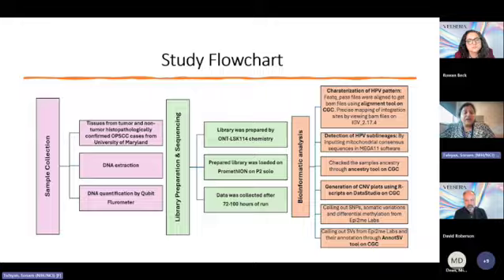SNPs and the somatic variations were called out from Epi2me Labs, which is the software for analyzing Oxford Nanopore technology sequencing runs. But the SVs were annotated through the AnnotSV tool on Cancer Genomics Cloud.